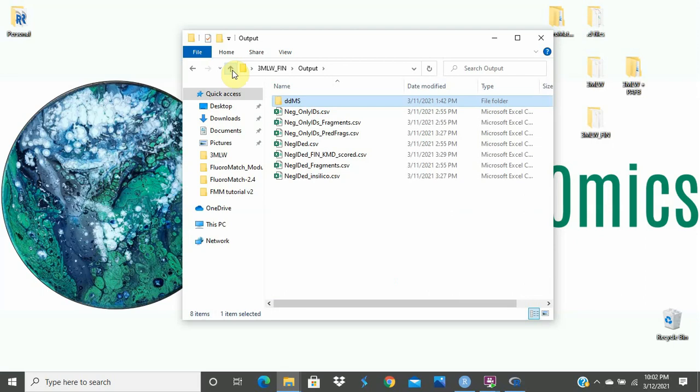Once all the folders have been completely populated, it will generate the final files. You will know the final file by the FIN in the naming. This may take some time, in some cases hours, after all additional and confirmed files are populated, and sometimes even hours after the neg ID'd CSV is generated.